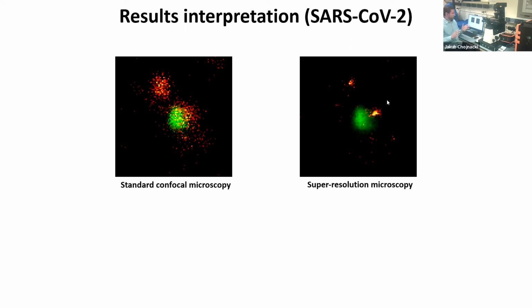So already, thanks to this very preliminary study, I see a little bit more about the virus structure using a relatively simple fluorescence microscope. All I did was label the samples. All I did was prepare those slides, put them on a microscope, and start imaging. And so thanks to advances in fluorescence microscopy, I can very easily get information about the structure of viruses without resorting to something such as electron microscopy. So this is exactly where the power of fluorescence super resolution microscopy lies for studies of virus particles.